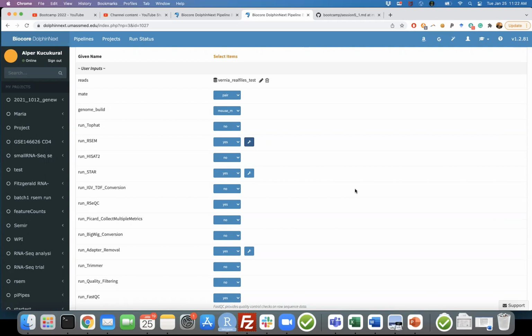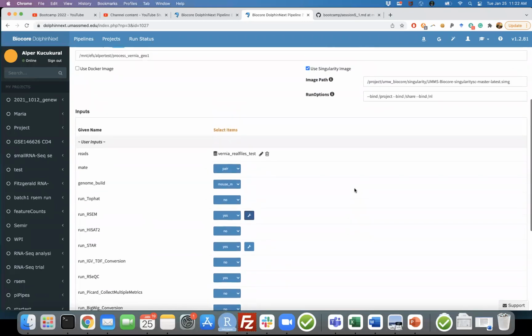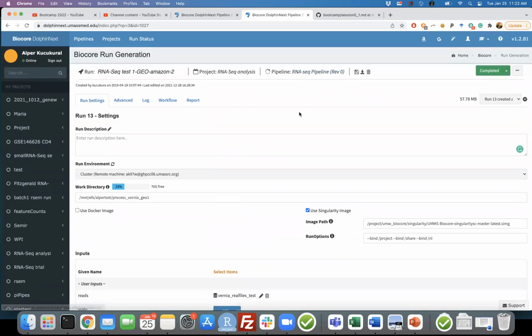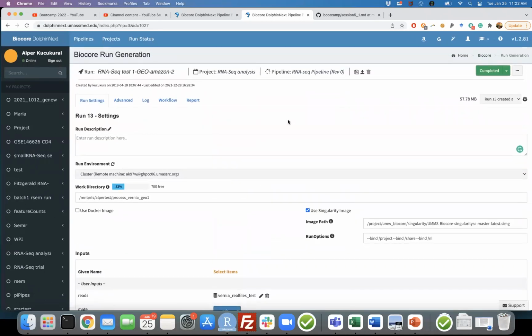Think of a measure to compare the tools to decide which one is better for your data. But I decided a long time ago that my thing is STAR. They're not too different. I use STAR. Okay, thank you. But I'm not telling you you should. You should try your own. Yeah, it's basically trial and error, right?